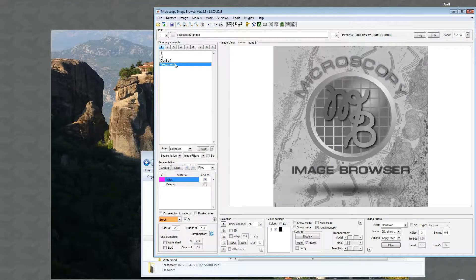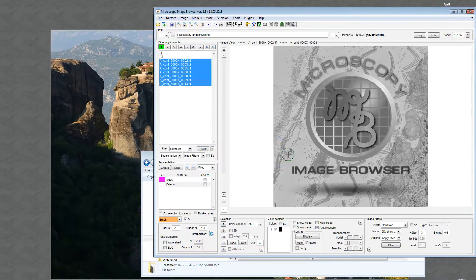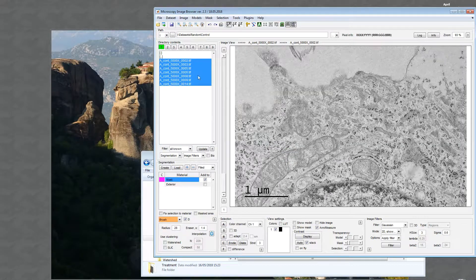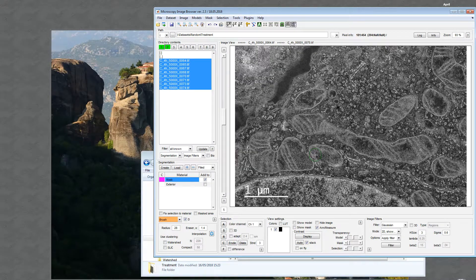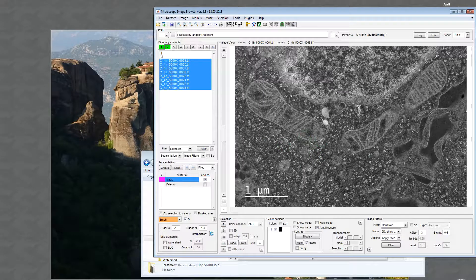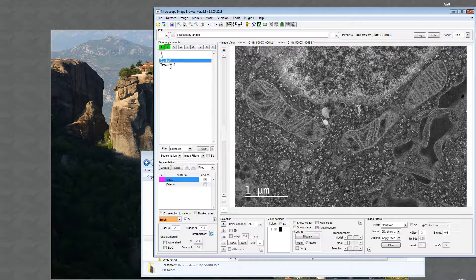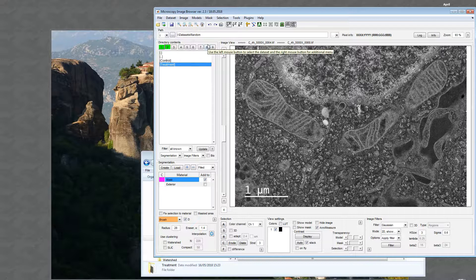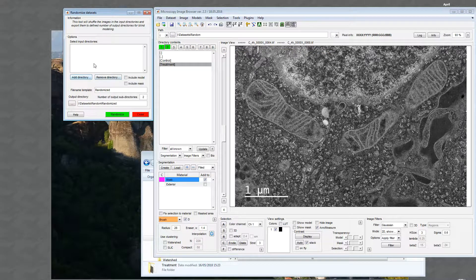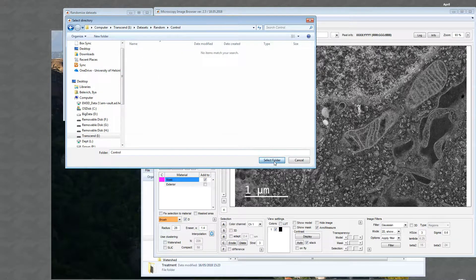This is the control cell — normal transmission electron microscopy images — and the treatment cells are similar images but inverted, so we can clearly see the difference when evaluating the results of the shuffling process. To start, go into the folder where you can see both directories, then go to File > Randomize Files > Randomize.